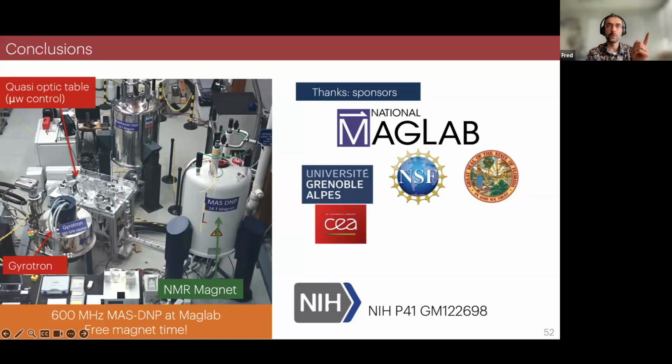It's affecting the T2. And as long as T2 is much longer than the rotor events, so the duration of the interactions between the energy levels, then it's not an issue. At least in the simulations I carried out, the way the T2 is introduced, it does not affect the enhancement. The T2 is not very critical here.